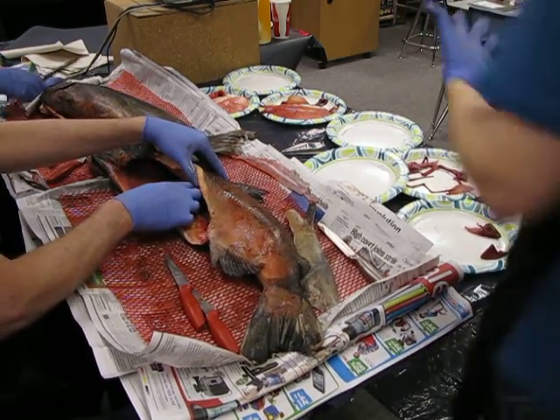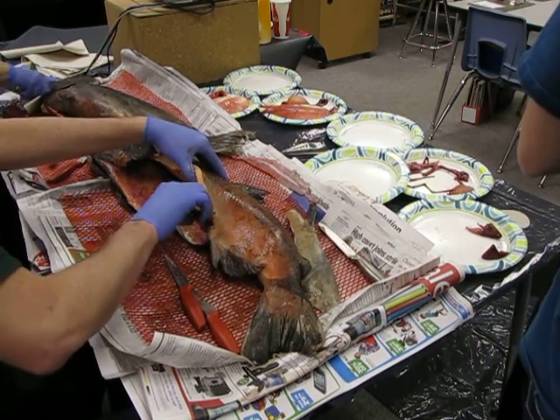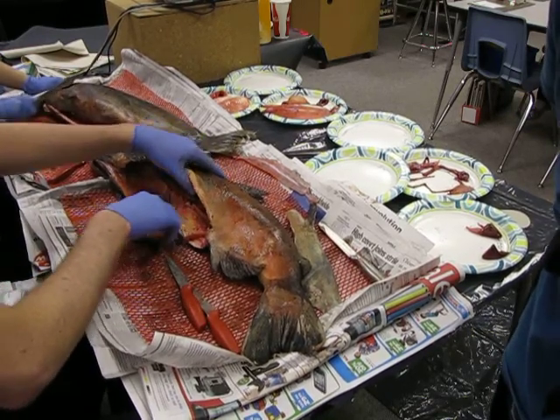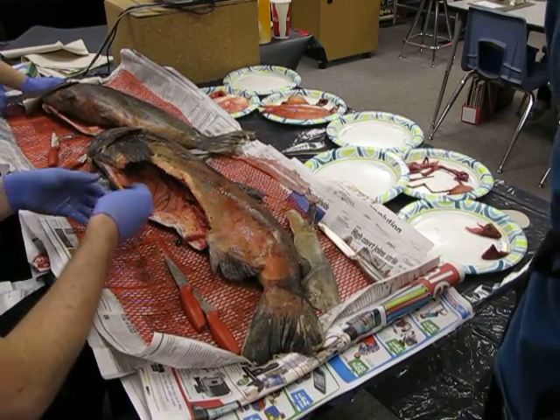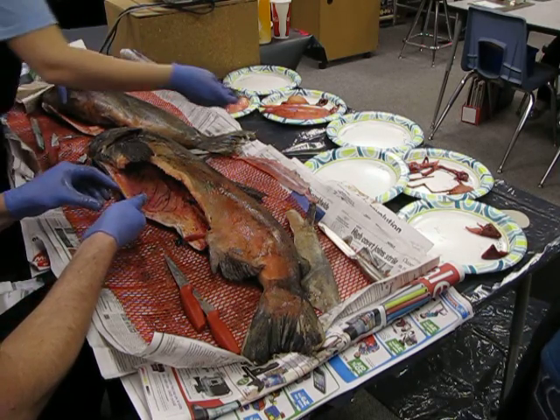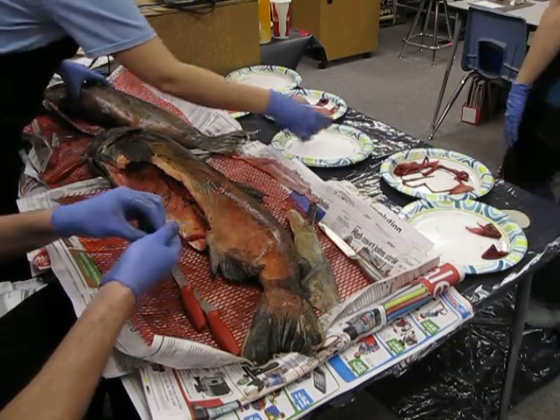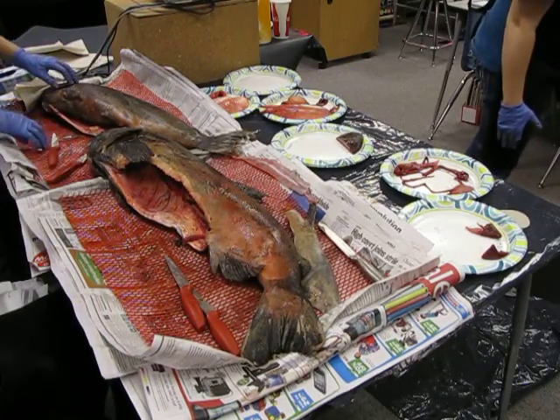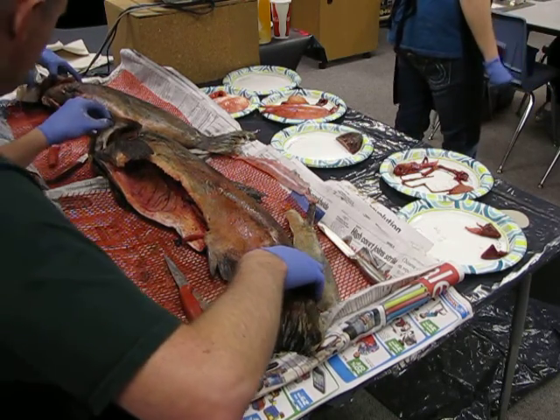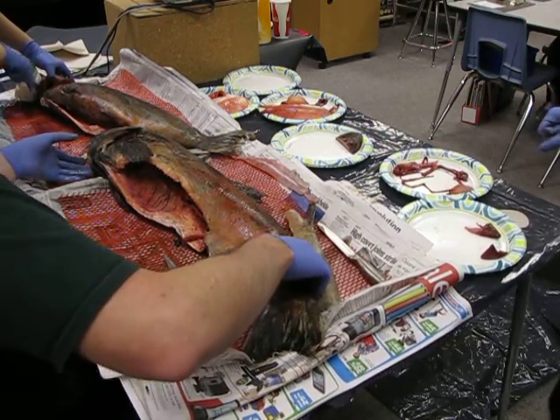Now, we have arms and hands. So if we want to eat something, some meat, we can pick it up, put it in our mouth, chew it, and our hands hold it in there. Our teeth move up and down, so we can use our hands to keep the food in there. Now salmon, they don't have hands, right? So when they're trying to eat something, they have to hope it stays in there. But their teeth actually help that food stay in there. So let's take a look at some of these teeth.